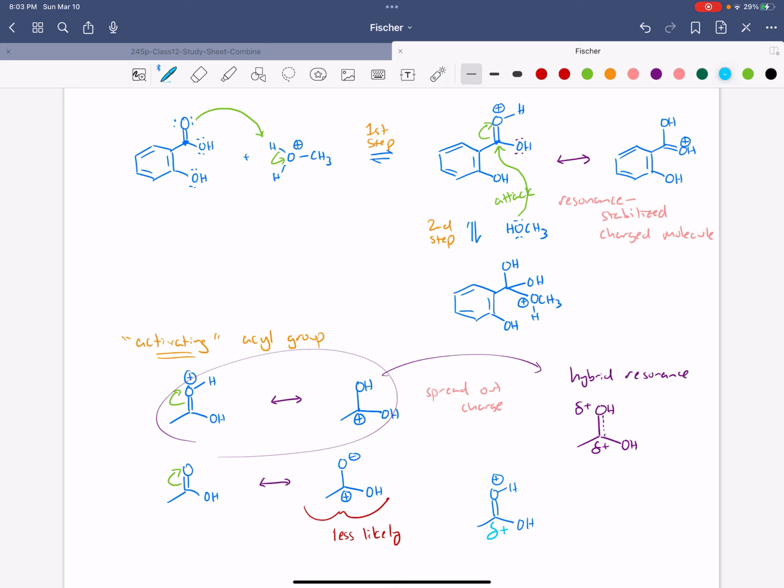In actuality, what you have is an ionic compound. This is called a salt. Ionic compound equals a salt. And that's this here. You have to recognize the metals that are used as cations in salts.